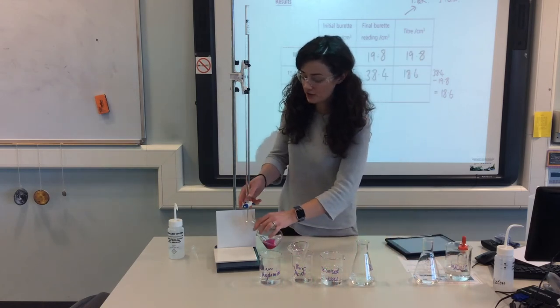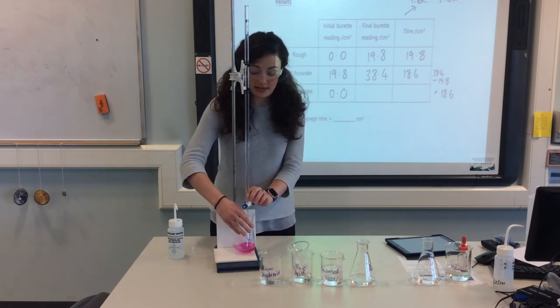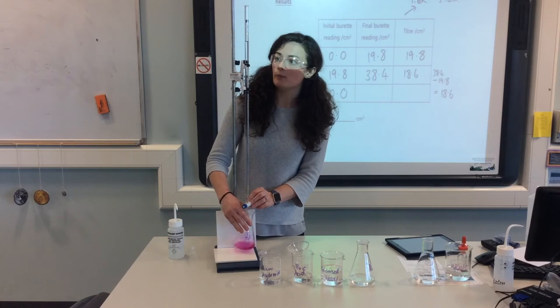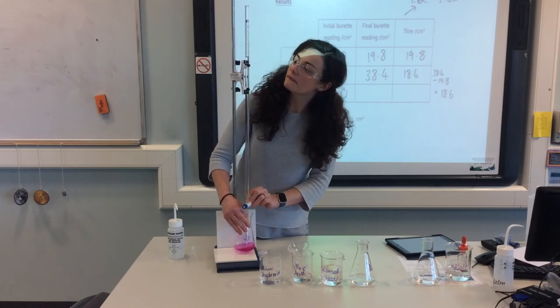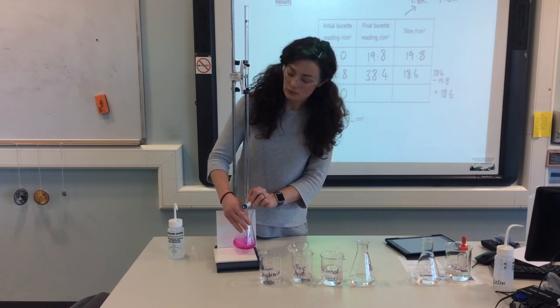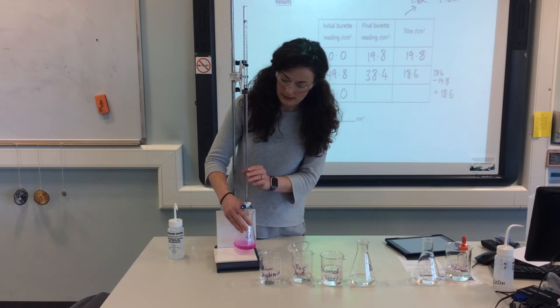Some people prefer to fill it up to zero each time just to make it easier to work out the values, and that's absolutely fine. It's just obviously a little bit more work. Okay, that's us at 13 now. We'll start to add it a wee bit more dropwise.